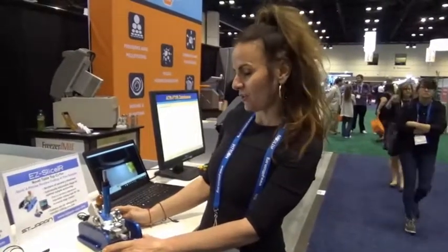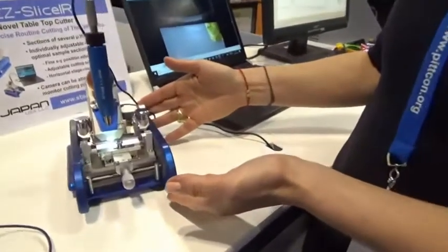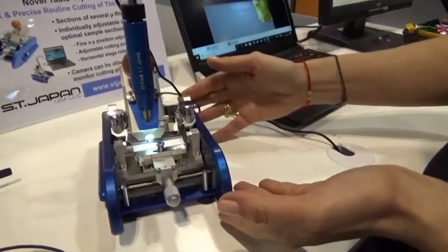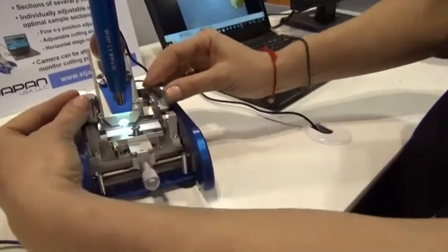This year we present you the new Easy Slicer Table Top Cutter. This is the Easy Slicer — a small and handy table top cutter with which you can cut thin films and thin materials into thin slices.